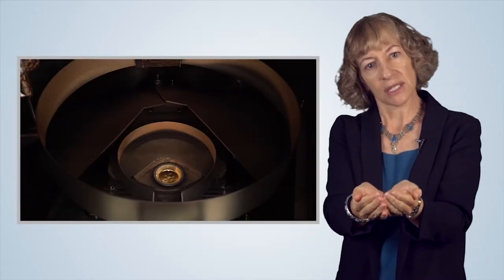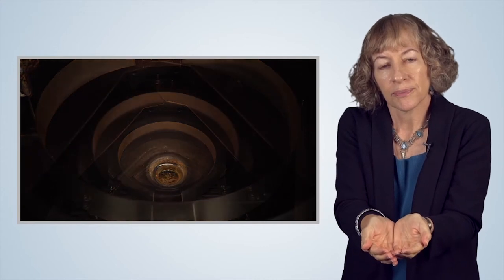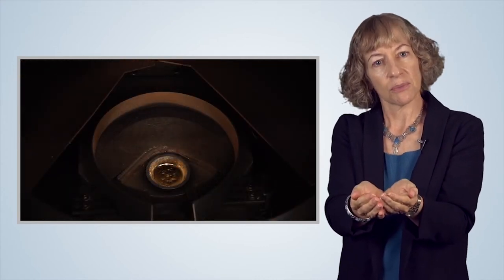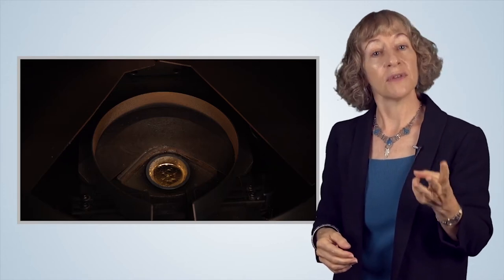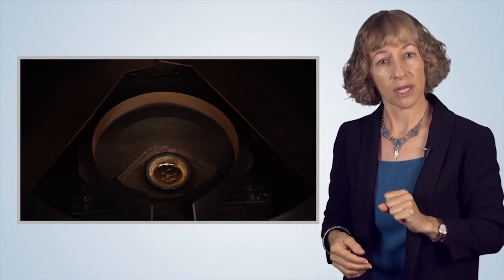The source material is contained in a small crucible. Depending upon the material being evaporated, the crucible will be made of tungsten, copper, or even a ceramic for very high temperature deposition.